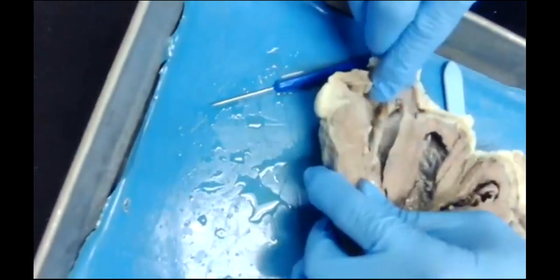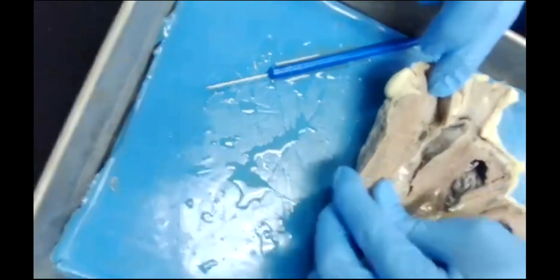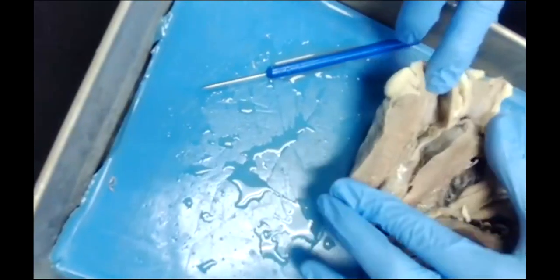Let me see if I can get one of the atria. So up here, this is going to be our left atrium, kind of where my fingertip is here.